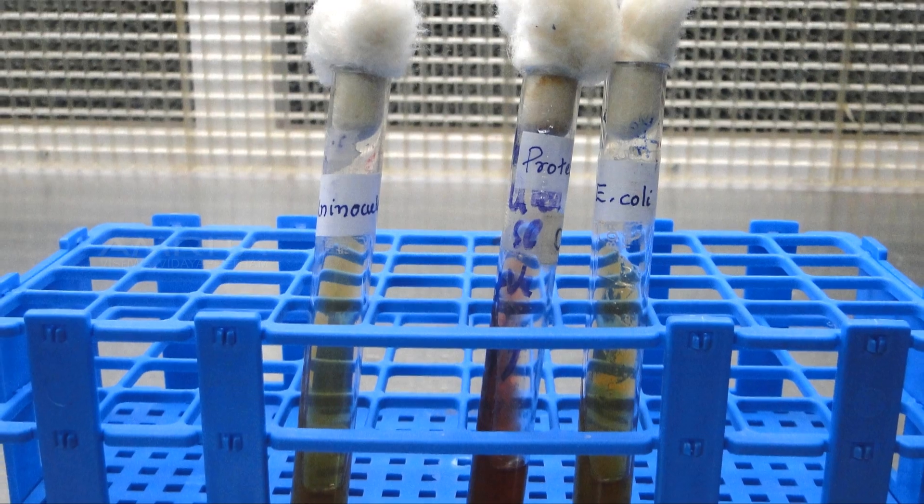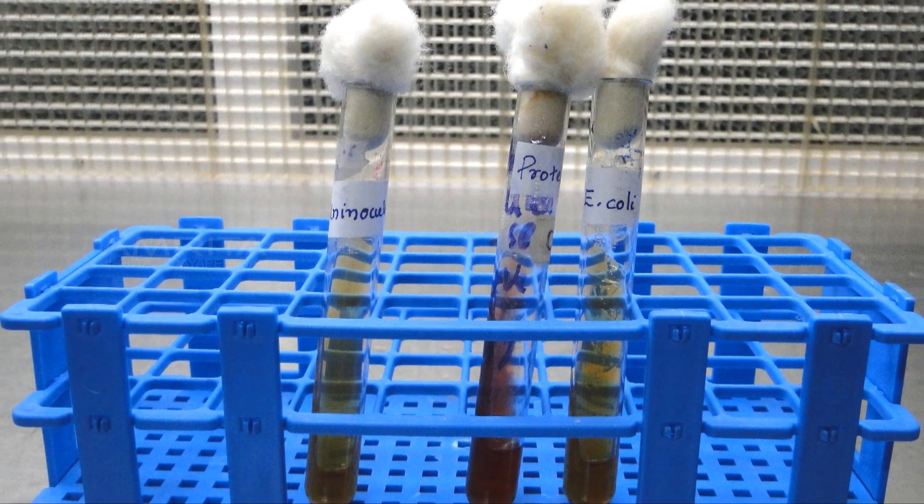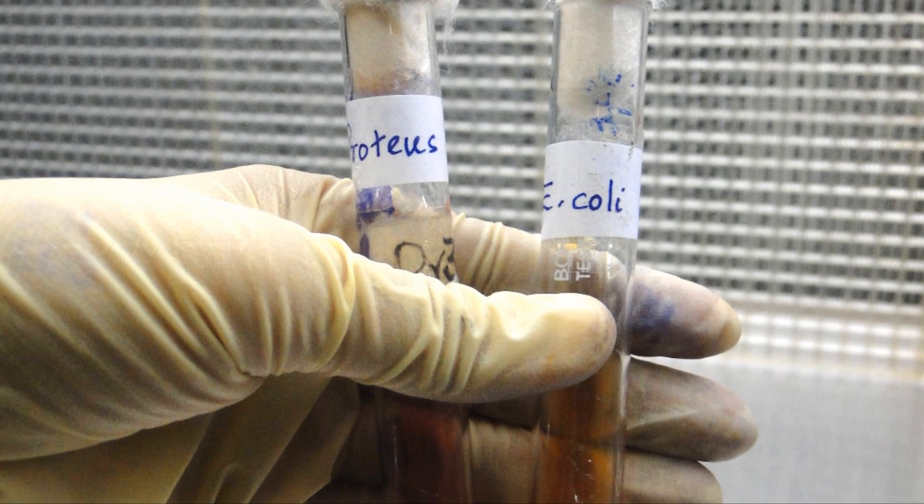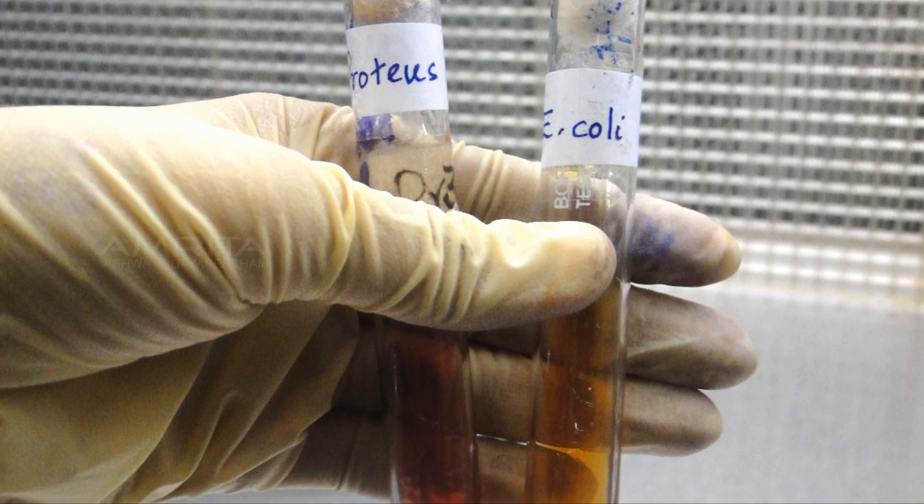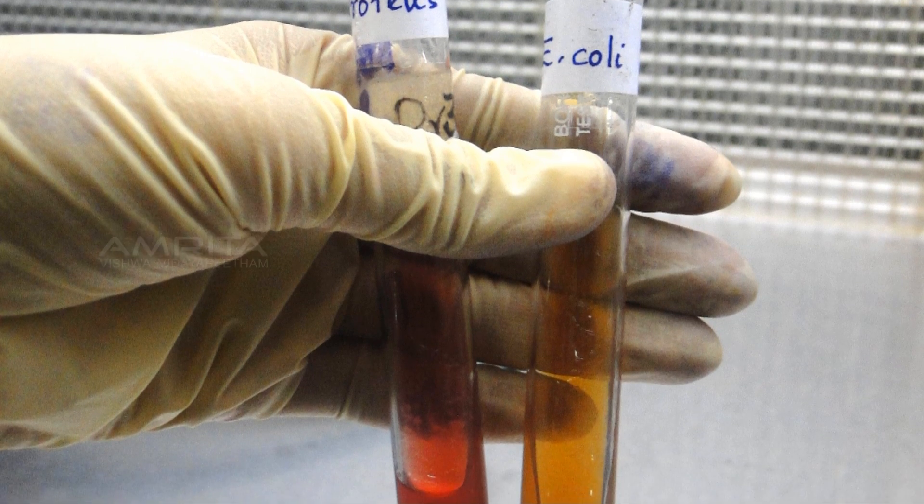After 24 hours, take out the slants from the incubator and observe the results. A positive reaction will yield deep pink coloration in the media, and negative results will yield yellow coloration in the media.